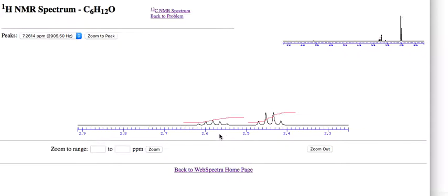So we have one hydrogen being split into a multiplet, and over here we have 2 hydrogens, so the height of the integration is twice as high as that. And this is very definitely a quartet. We've got a 1 to 3 to 3 to 1. It's a very lovely little quartet there. Okay, so the first peak over here is a multiplet with 1 hydrogen. This peak over here is a quartet with 2 hydrogens.